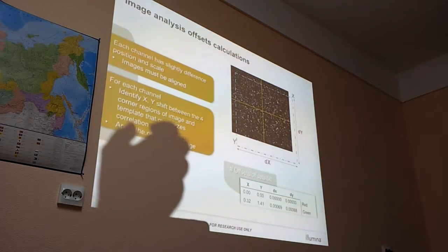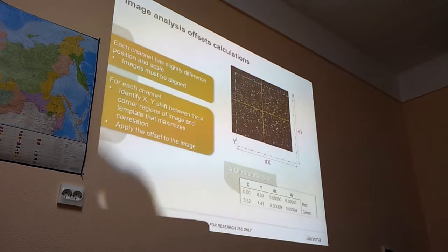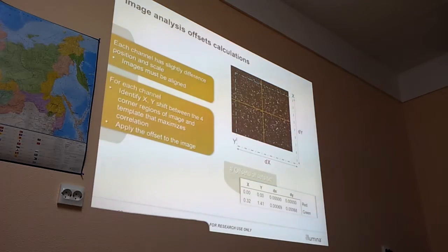So you have almost identical sequences in most of the clusters, or in many of the clusters. Maybe you are only looking for one mutation, and then this normalization and offset matrix calculation does not work properly. Yeah, because from one cycle to the next, you have huge differences in intensity. Normally, it should be a kind of random distribution of intensities.